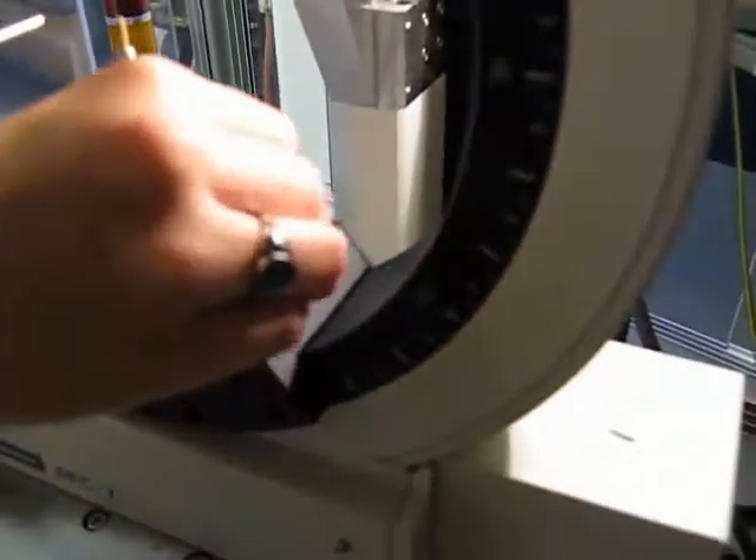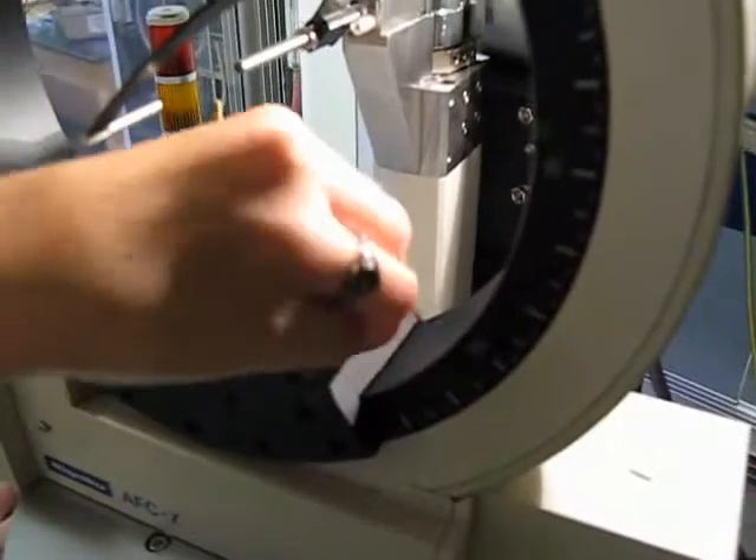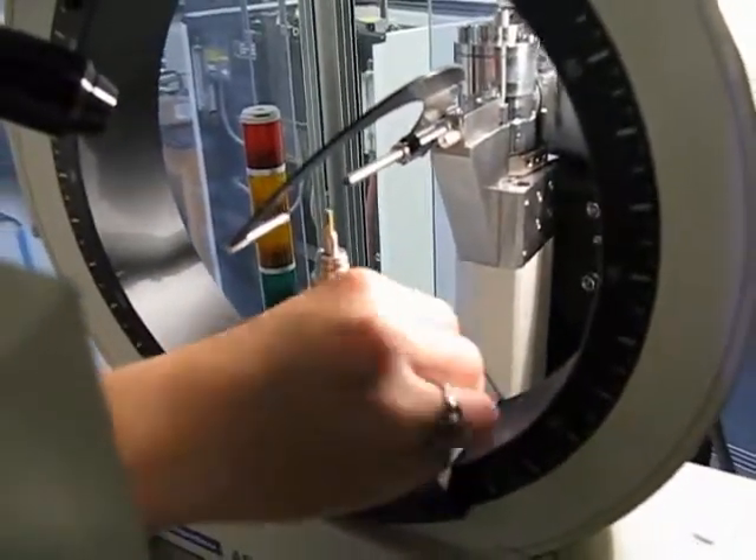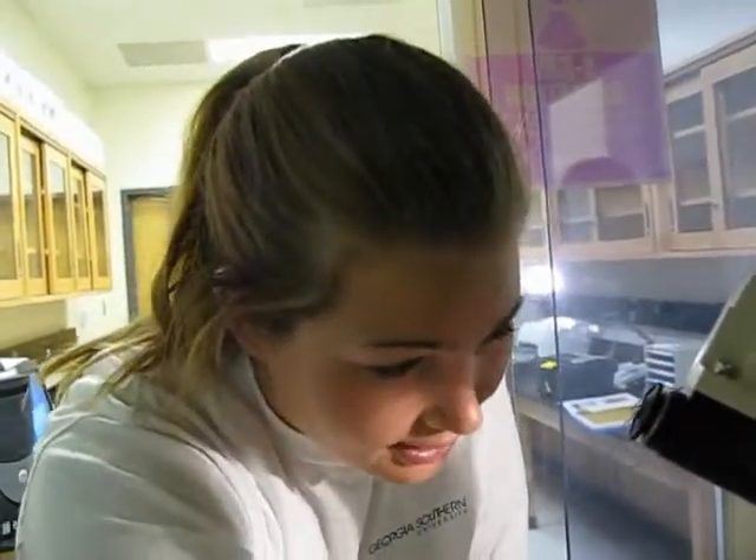There we go — that simple. Now we're going to replace the thumb screw. Can you tell us why does the thumb screw have to be well lubed? Well, it's not the thumb screw that has to be well lubed — it's the machine. So once we put the oil down in there, it's going to travel through. And this is just to hold it in place.